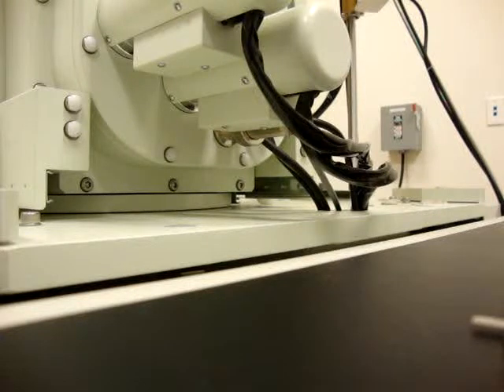When you look at a sample dead set in the middle, you have a little bit of focus above and a little bit of focus below for height. If you tilt through that focus, the part of the picture up here and down here is out of focus. Some scopes tilt forward; we tilt left and right, so our pictures are out of focus. Especially with relatively flat samples with large degrees of tilt, you'll get left and right out of focus.